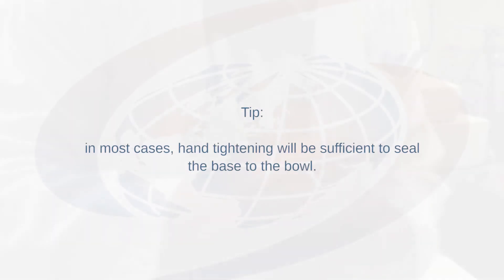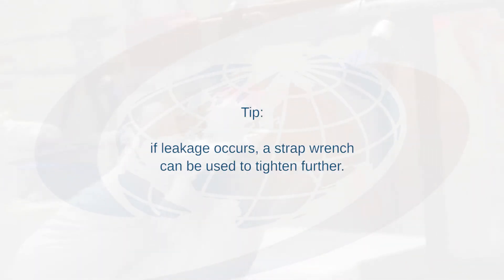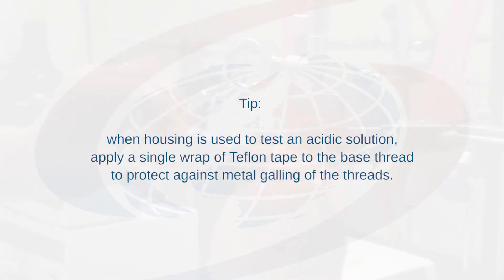In most cases, hand tightening will be sufficient to seal the base to the bowl. If leakage occurs, a strap wrench can be used to tighten further. When housing is used to test an acidic solution, apply a single wrap of Teflon tape to the base thread to protect against metal galling.